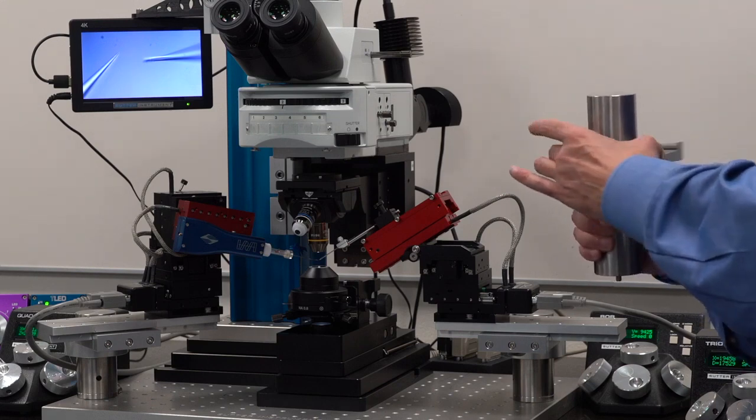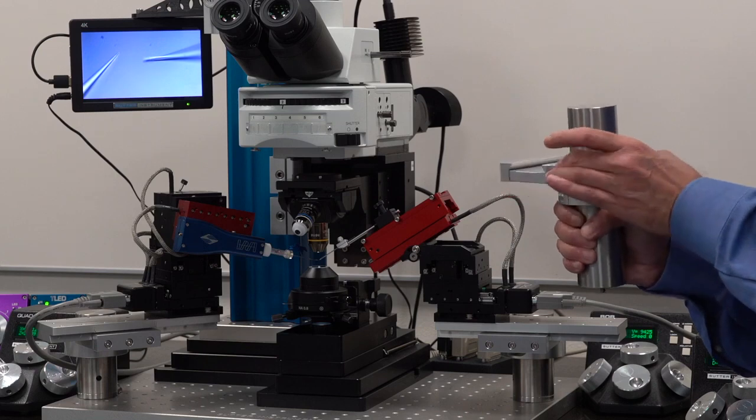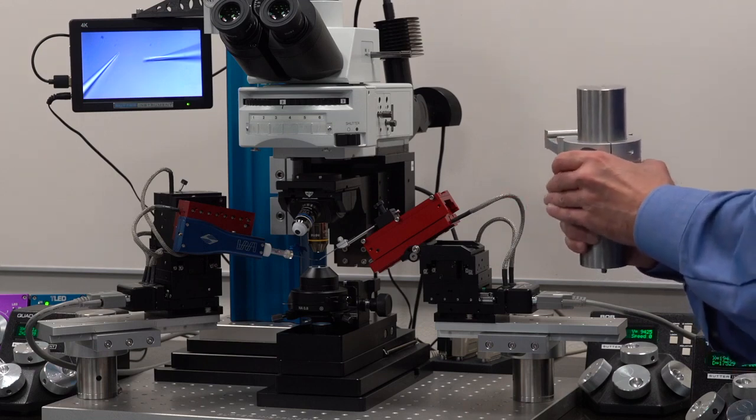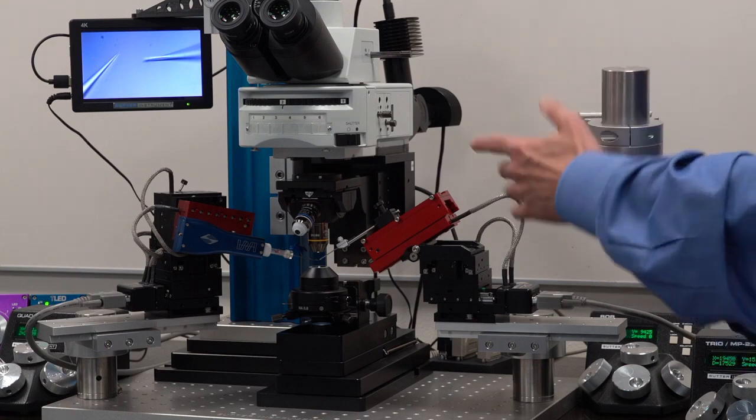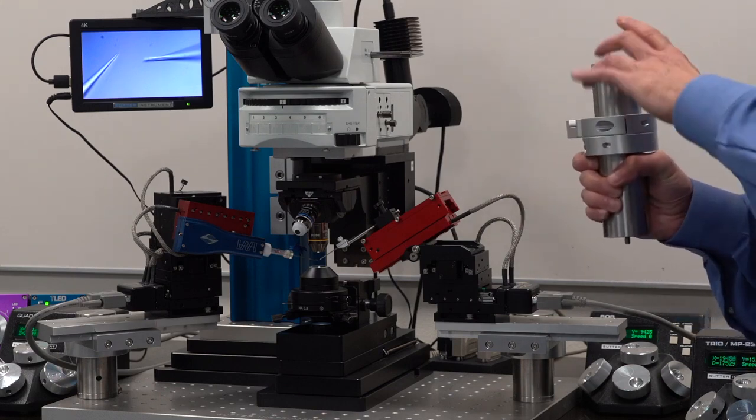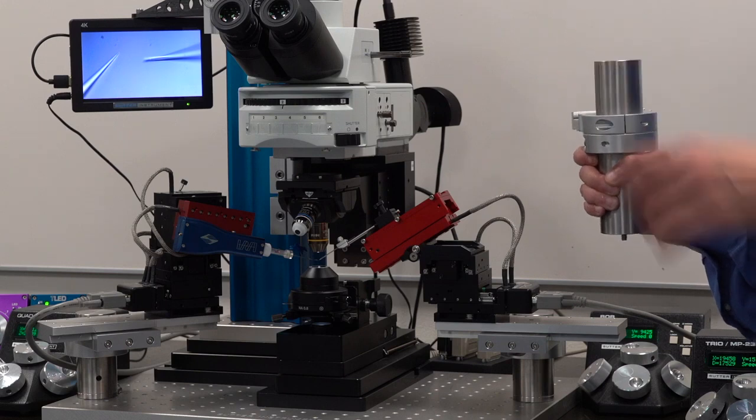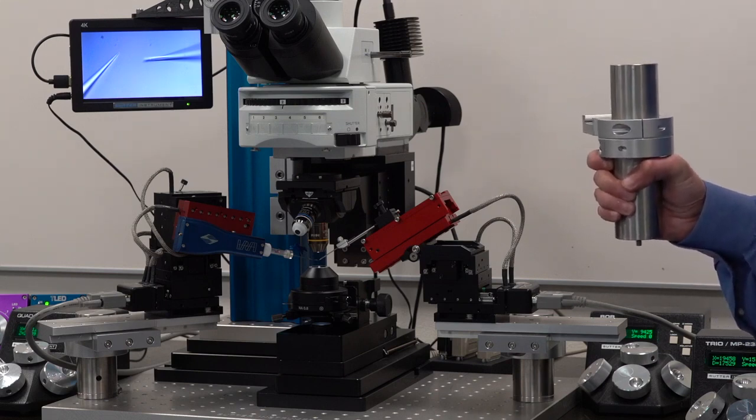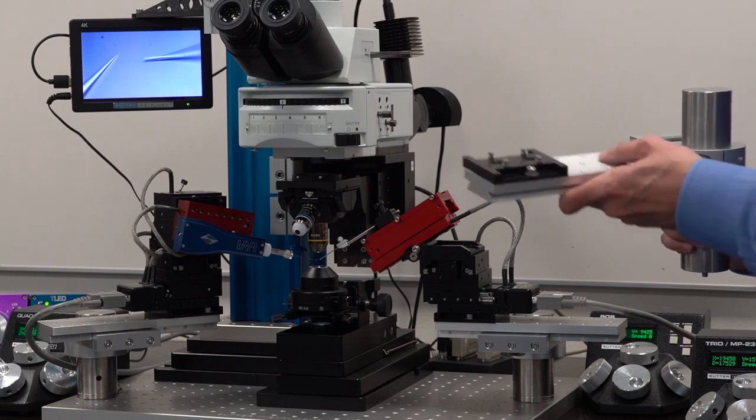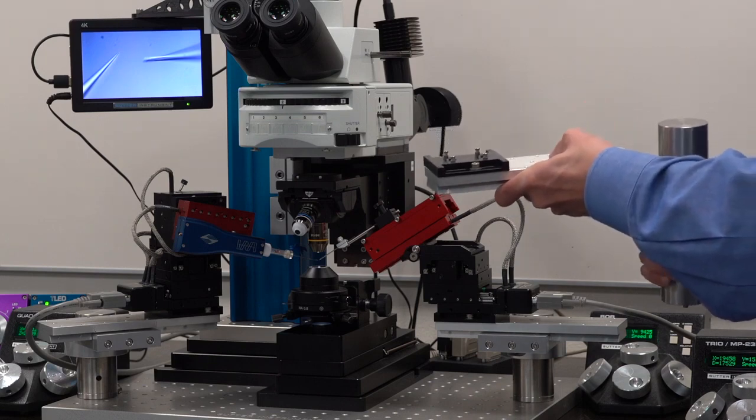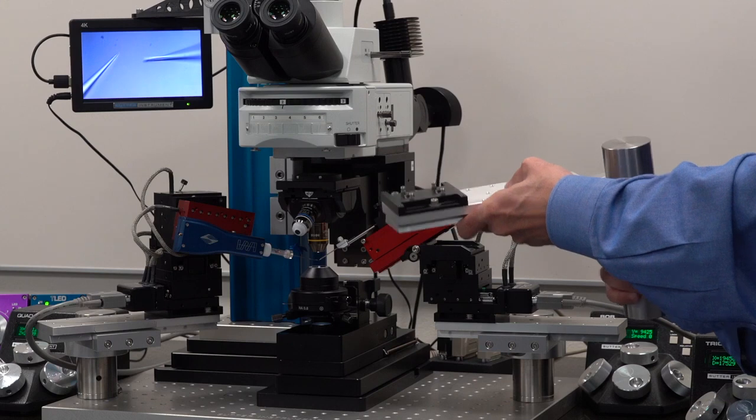The Y can be adjusted by rotating this around, and the Z can be adjusted by going up and down. If you need this taller because you have a very tall microscope, we can make you longer center post. The more important as compared to our competitors, I like the fact that we have maintained our X freedom.